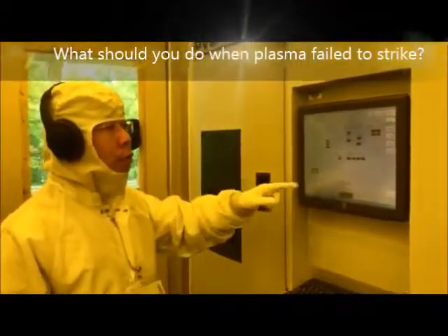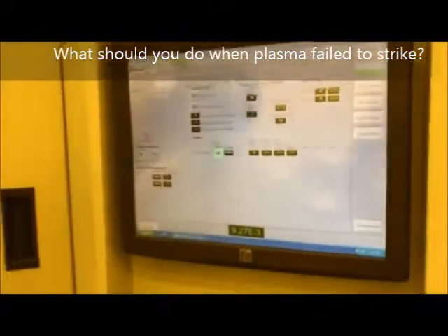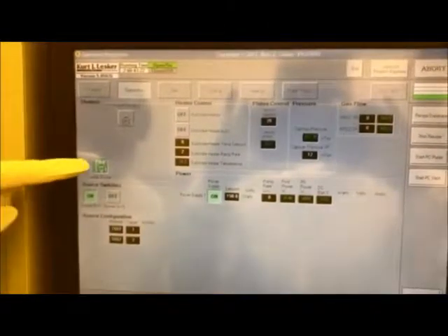Sometimes when you increase the power and reduce the pressure, the plasma may go off. If you see the plasma go off, the first thing you can try is to open the shutter. Sometimes opening the shutter changes the plasma chamber condition, and then the plasma will ignite. And once the plasma ignites, you can close the shutter back so that you can control the deposition rate.